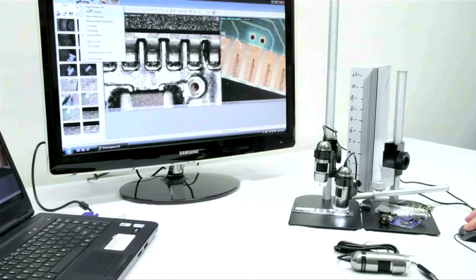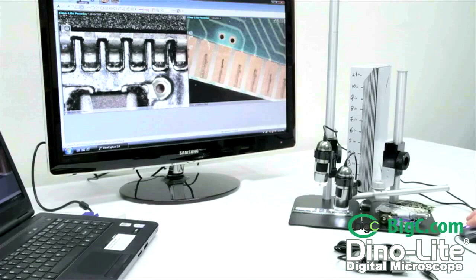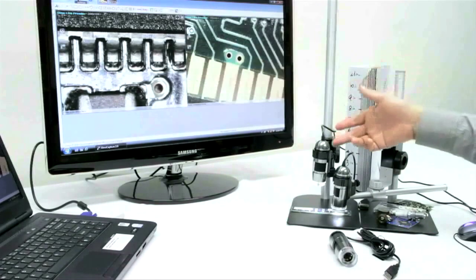If you would like to compare your images side-by-side, simply go to your settings tool and deselect the image list. This will eliminate the image list to the left, opening more room onto the screen, enabling you to set pictures side-by-side for comparison.